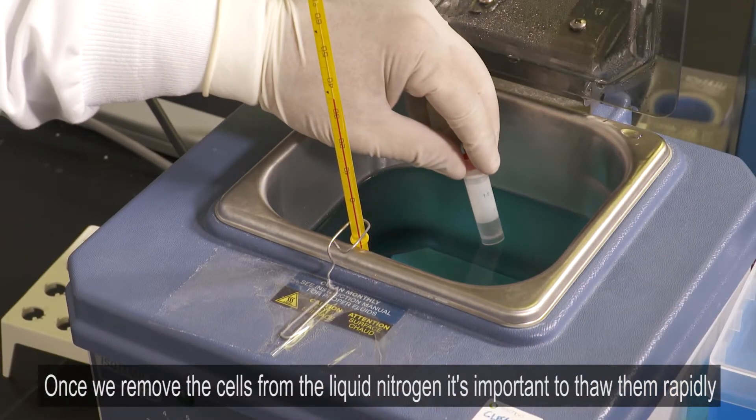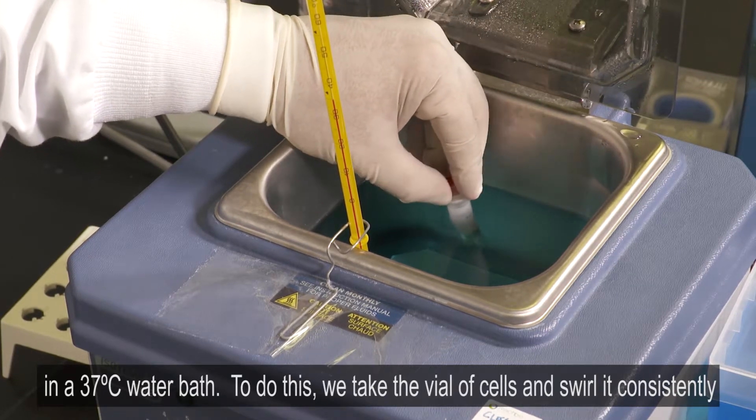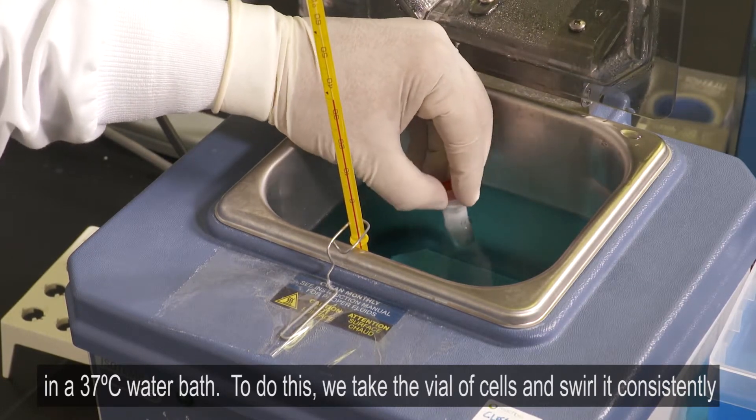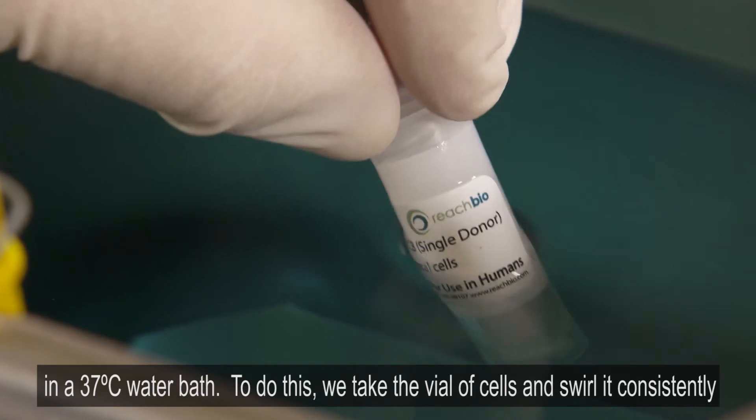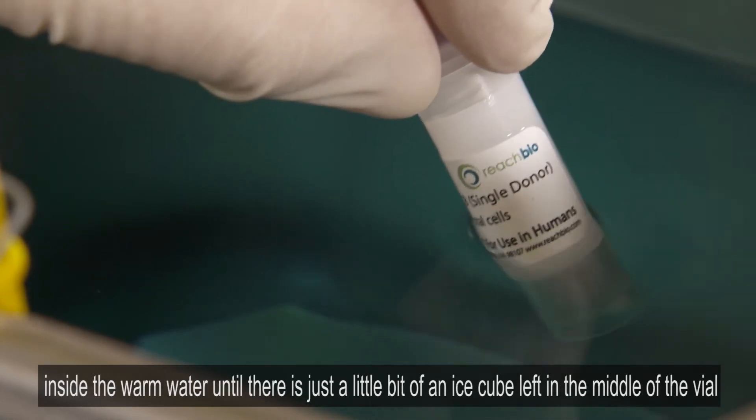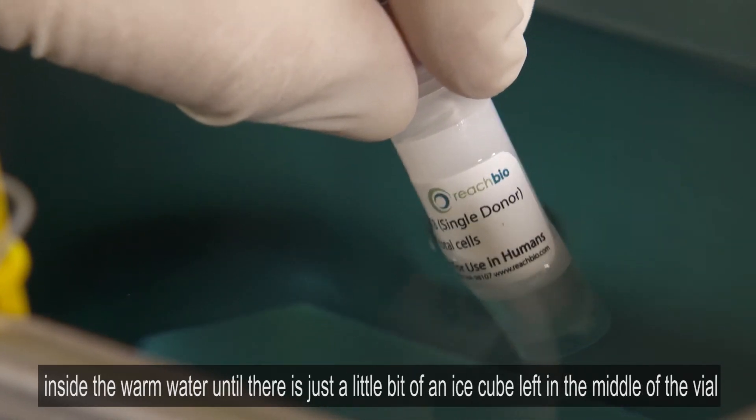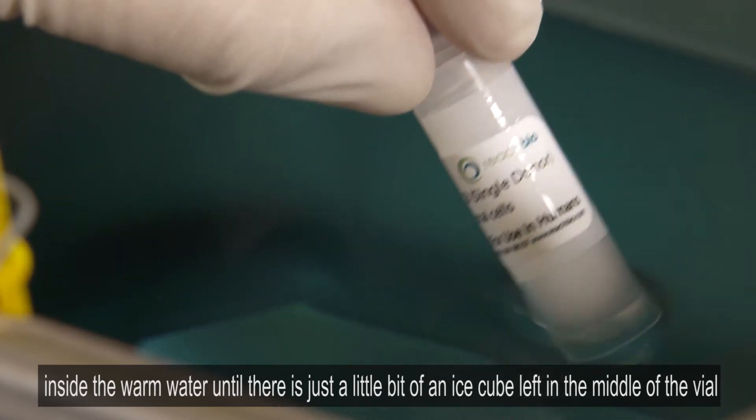Once we remove the cells from the liquid nitrogen, it's important to thaw them rapidly in a 37 degree Celsius water bath. To do this, we take the vial of cells and swirl it consistently inside the warm water until there is just a little bit of an ice cube left in the middle of the vial.